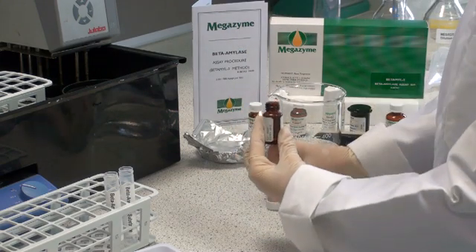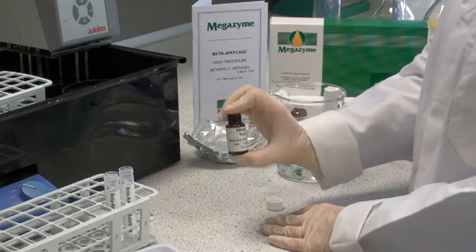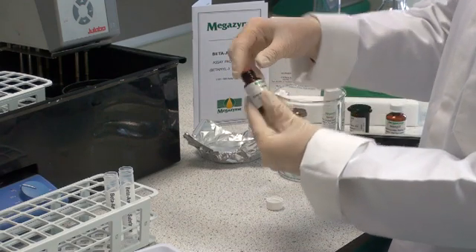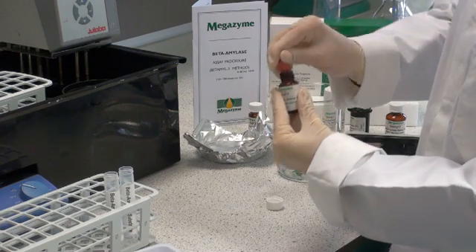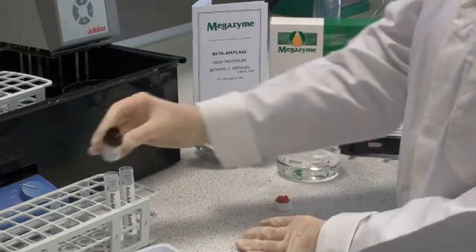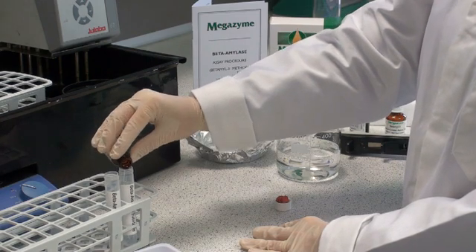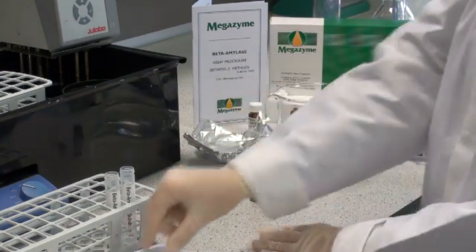Cap the vial and mix well to ensure that all of the substrate is dissolved. Just check visually to ensure that this is the case. Then transfer the solution into two polypropylene containers, and these will be stored at minus 20 degrees centigrade between use and on ice during use. This ensures maximum stability of the reagent.